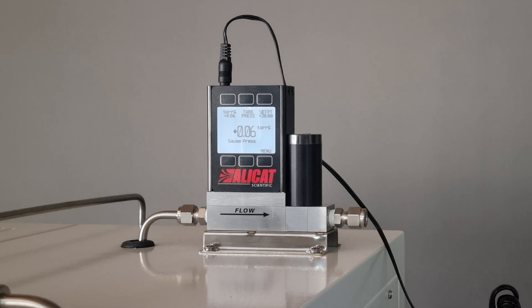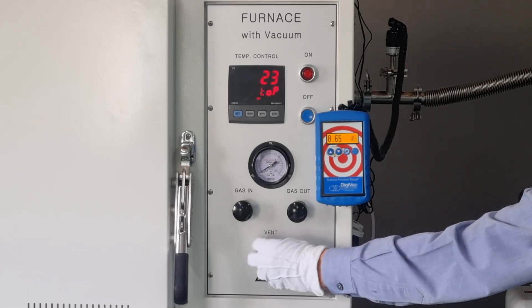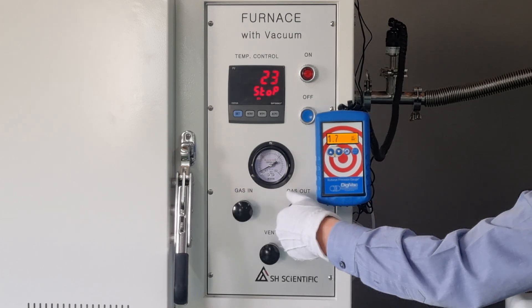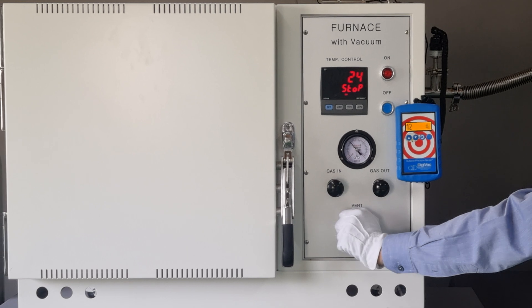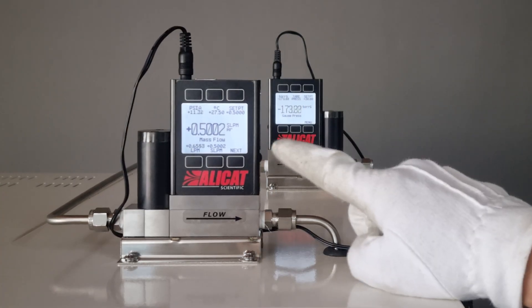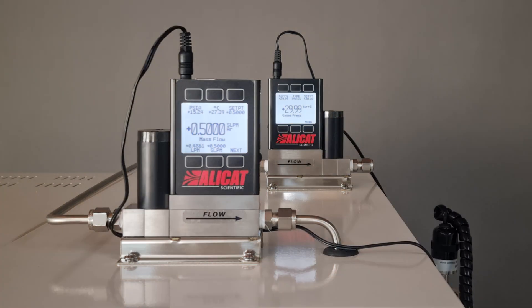By now, you've connected your gas and set up the MFC and BPR, so it's time to load your materials into the chamber. Remember to open all valves — gas in, gas out, and the vent. This enables the gas to quickly flood the chamber in the beginning. Once the chamber pressure is above atmospheric pressure, close the vent valve so the MFC can take over and accurately control the gas flow from here on out. The BPR will initially go up and down around the setpoint, and will eventually settle right on the setpoint.